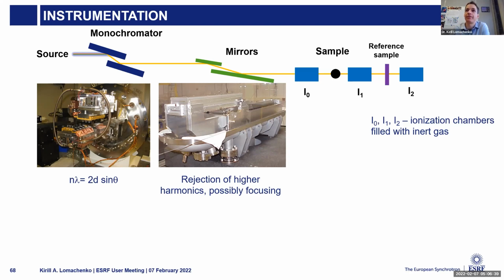In the former case, with really a physical thing happening with your sample, the spectrum of the reference sample should stay the same. On the contrary, when it's a monochromator thing, so it's an experimental error, let's say, the reference spectrum should drift as well. So we can use the reference spectrum to align the spectra of the samples, because the reference spectrum should stay always at the same energy, because nothing happens with the reference sample. There is no chemical treatment, there is no heating, there is nothing.